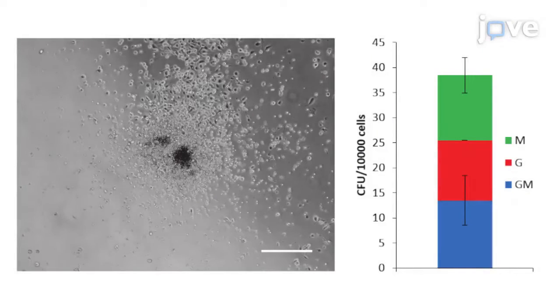We offer a robust platform to produce blood cells from human pluripotent stem cells. The main advantage of this technique is that we get consistent and precise yields of hemogenic endothelial cells. We expect that our platform will enable broad applications in disease modeling and screening for therapeutic compounds.